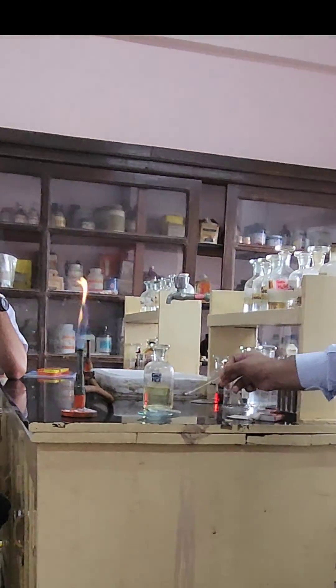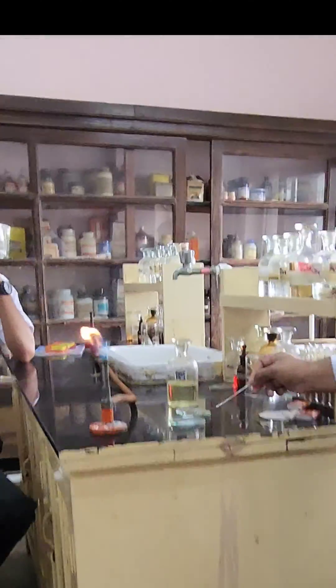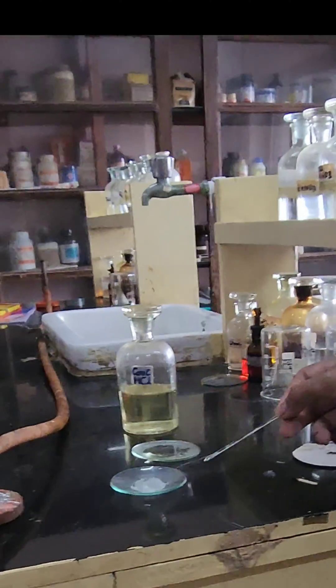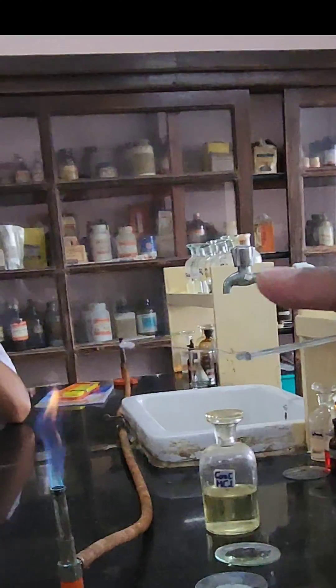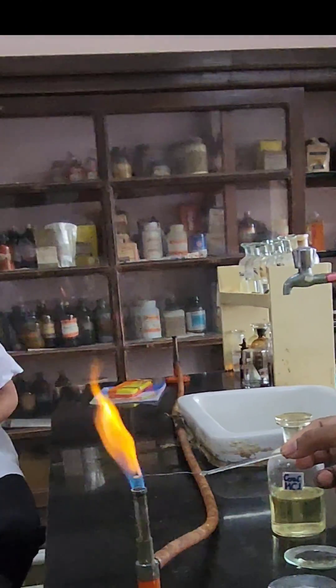After moistening it, we are going to mix the HCl and the salt, and you can see that some salt has got entrapped on the loop. Then we are allowing it to go into the flame.